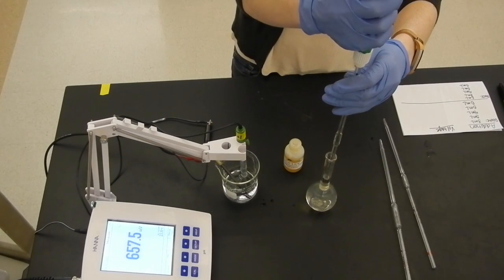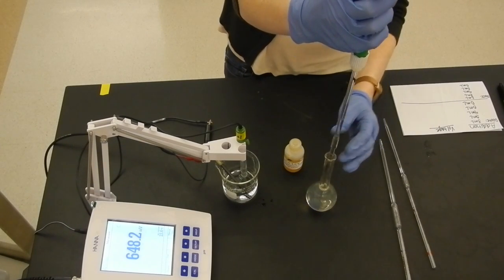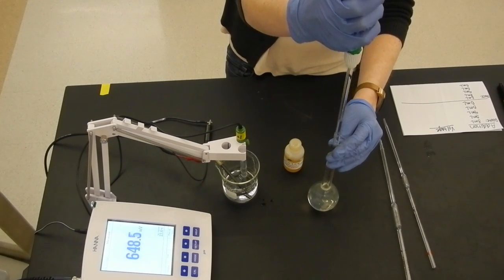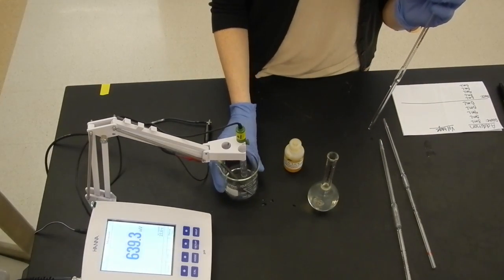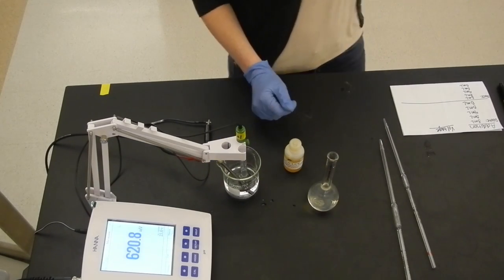Carefully pipette the first portion of the dilute iron 2 solution into the reaction beaker. Make sure the reaction beaker is well mixed and record the millivolt reading.